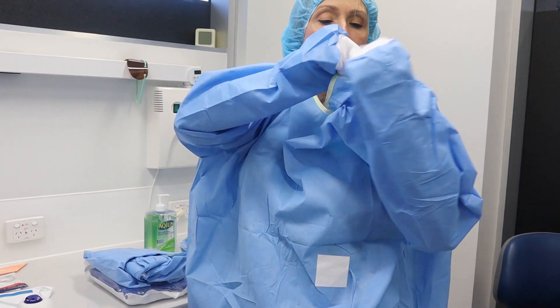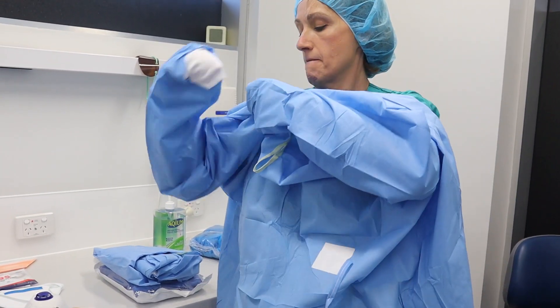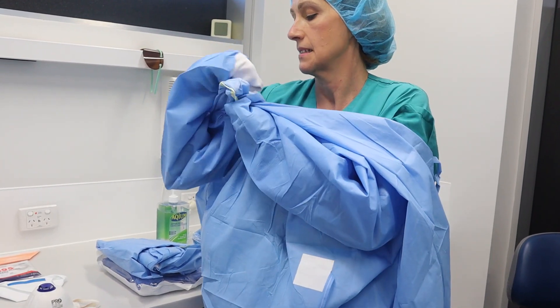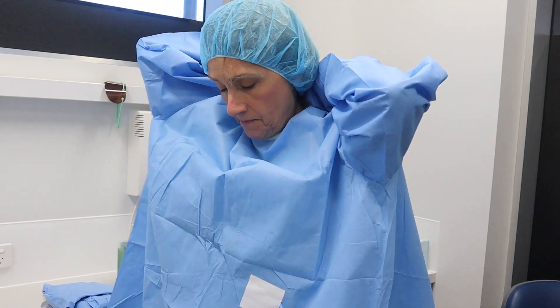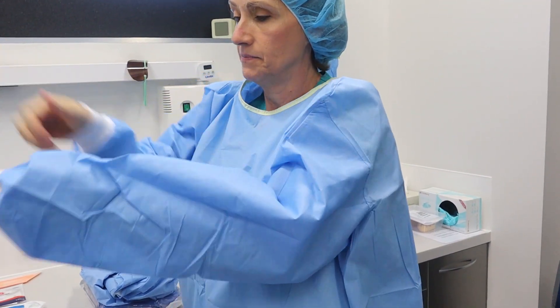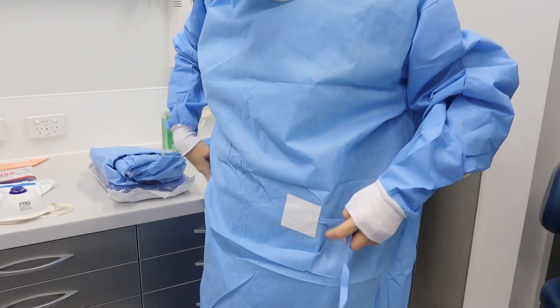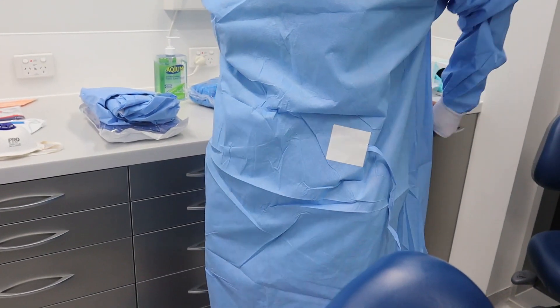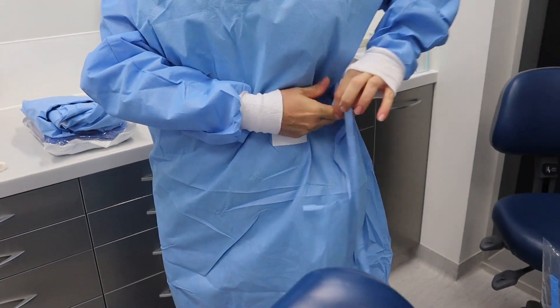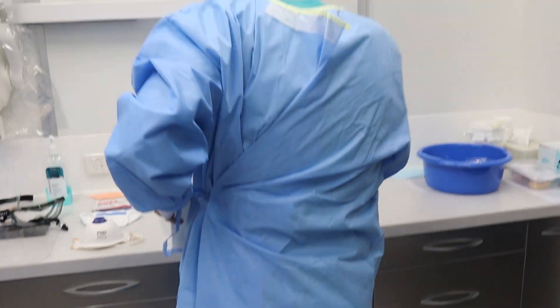I'll raise it high at the neck and wrap it around to make sure my back is covered as well, so my whole body is covered.